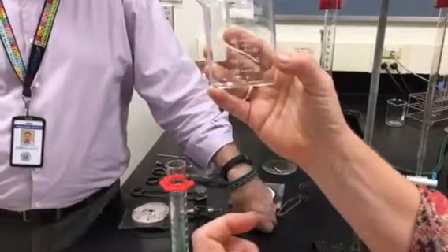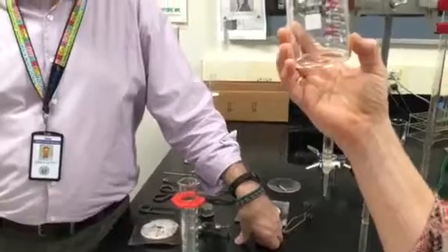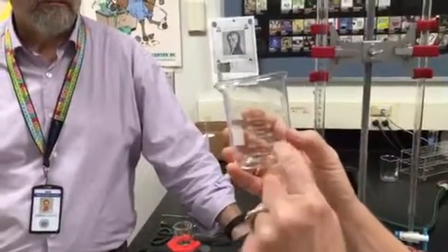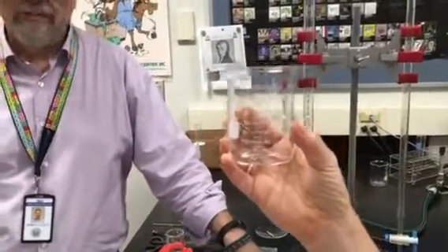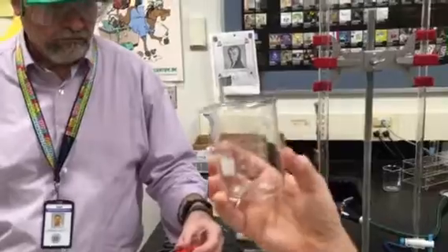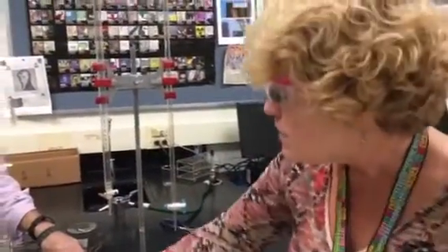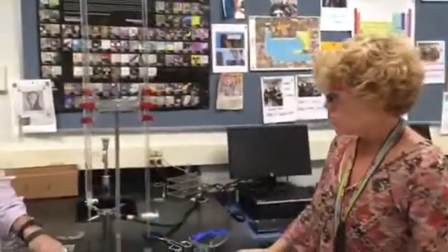So you should be able to measure by ones, but even though it does go up by 20, 30, 40, I would never use a beaker to measure, okay? They're not measuring instruments. They're used to basically take some acid from the hood, and then you're going to pour it into a graduated cylinder, okay? So even the smaller ones, they're not used to measure. Not great measuring tools, okay?